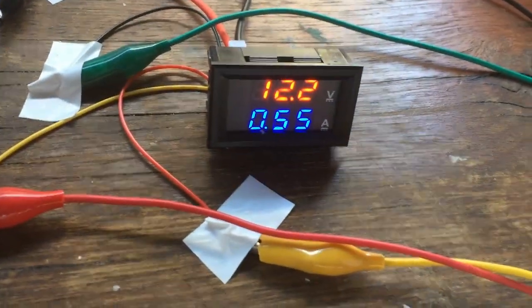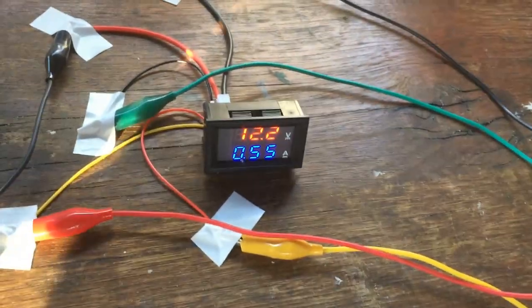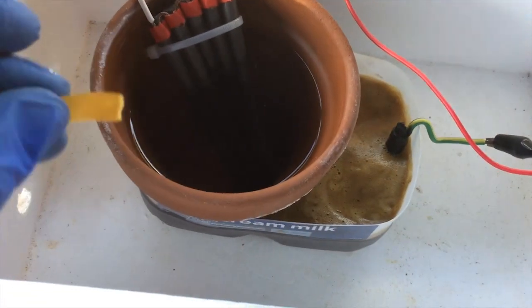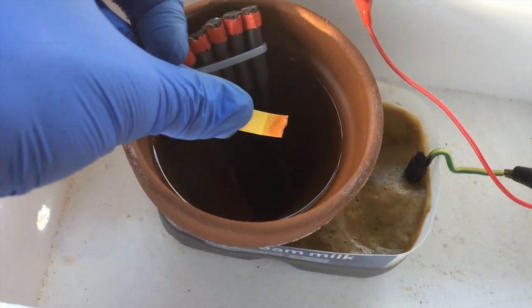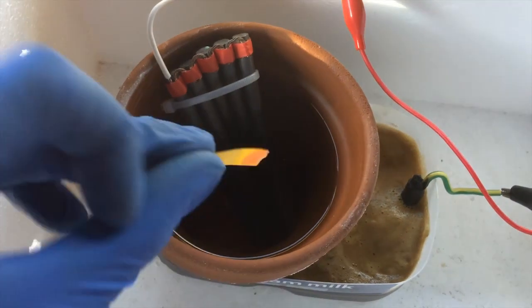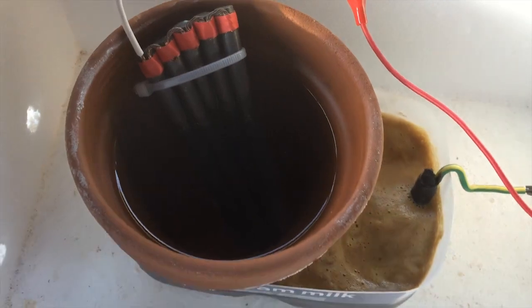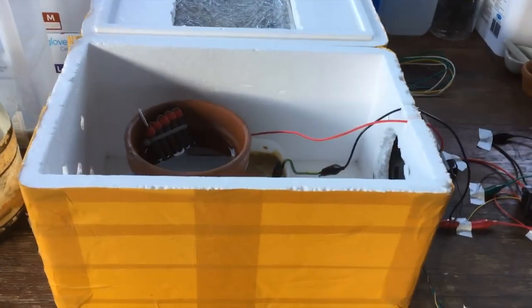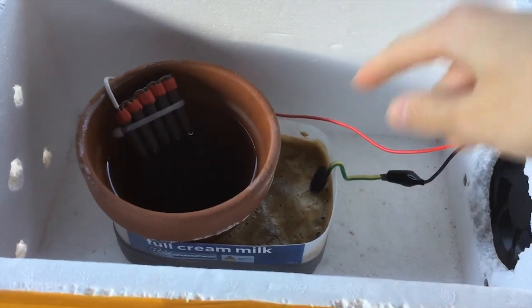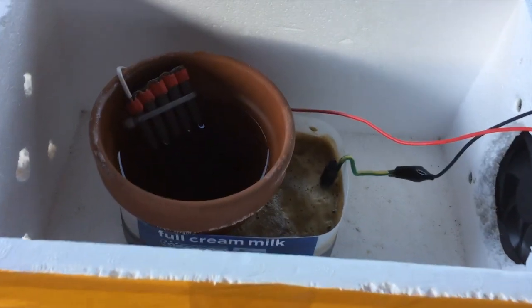Nearly an hour on and we've got over half an amp flowing now. Dipping some pH paper in shows it's starting to turn a little bit acidic in the anode chamber, which is exactly what we're looking for. I'm going to leave this going overnight, maybe even a couple of days, just to make sure all of the nitrate content in our catholyte gets dragged over and turned into acid.